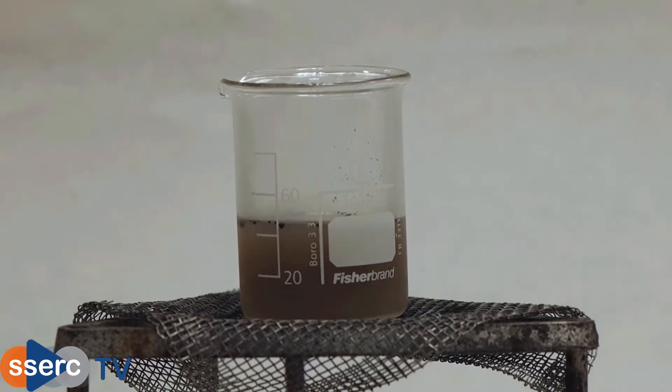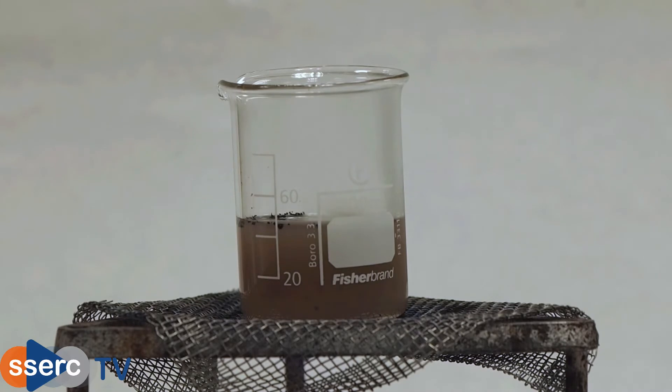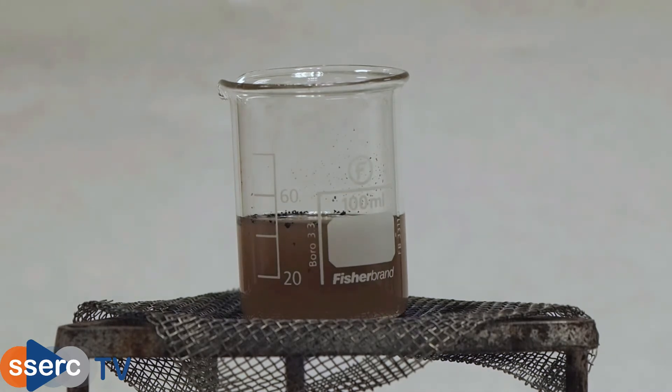We do this by boiling it with dilute nitric acid, 40 cubic centimeters in this case. Add the nitric acid to the ash and bring it to the boil and keep boiling for about five minutes.